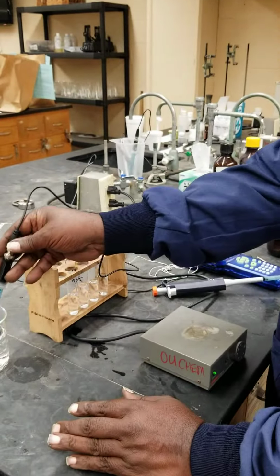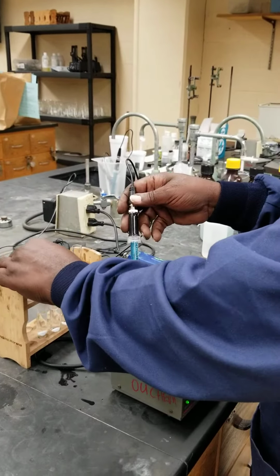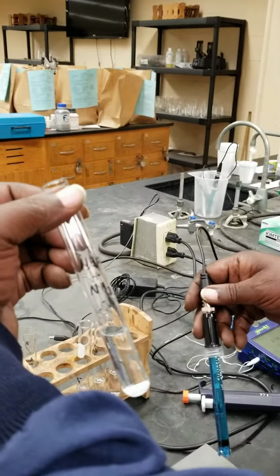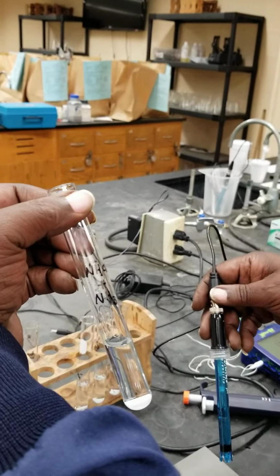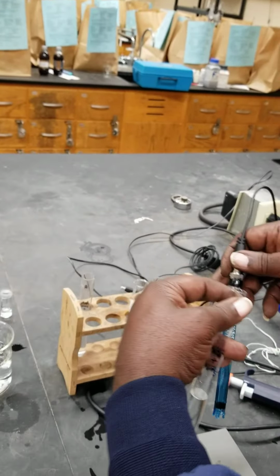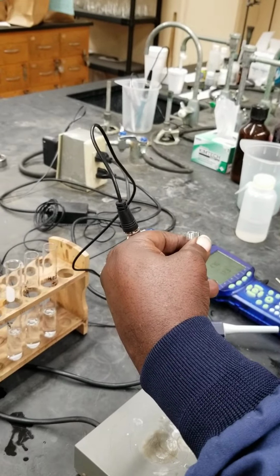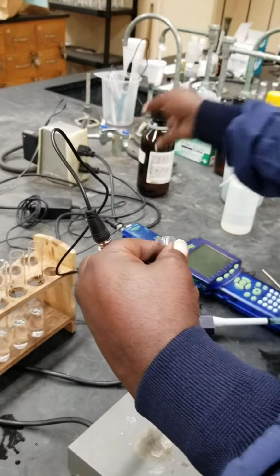Now going to the next one. The next one is ammonium chloride. So NH4 plus is the acid and the base is NH3. So I'm going to move my sodium acetate out.